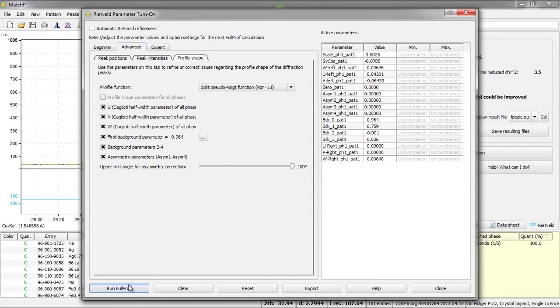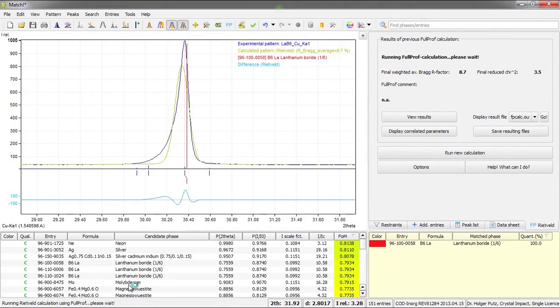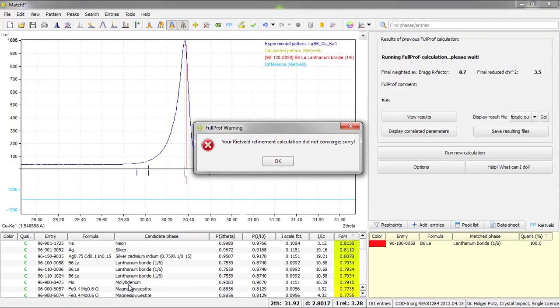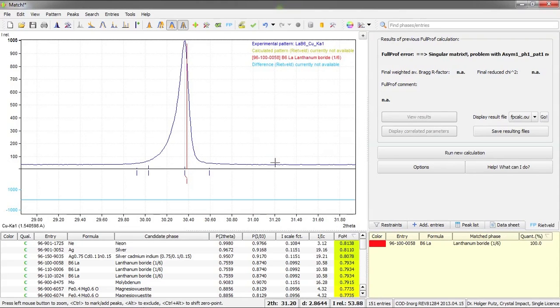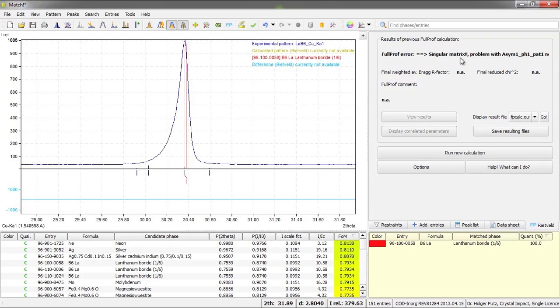So if you now press run full prof the calculation will be performed. And oops, it didn't work. In this case the calculation did not converge. So maybe I have to change the model, that is the parameters I would like to vary. In this case we have a singular matrix, probably because of some problem with the asymmetry parameter, but I'm not sure about this.